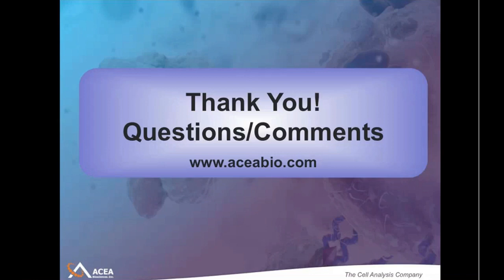All right, and I have another question. I've heard that values over 100% in the compensation matrix are bad. What do you think? Okay, so this is kind of another controversial area in flow cytometry. It's a pretty deeply rooted edict of flow cytometry that compensation values over 100% are not good. And I completely understand where that comes from.